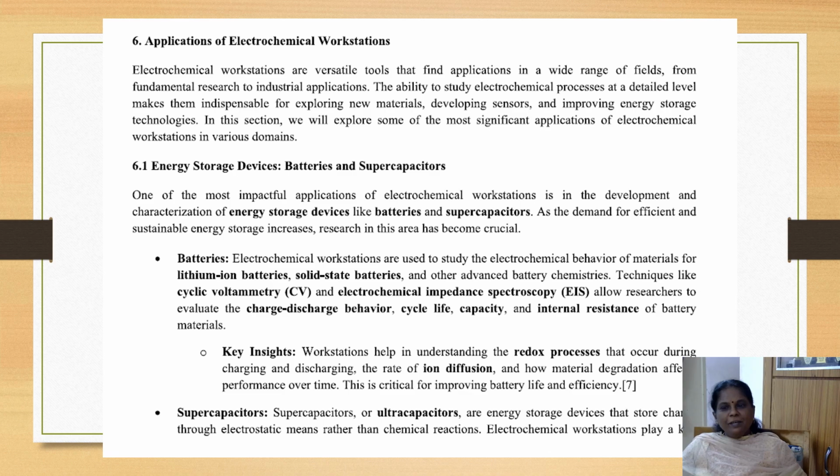So let us now see the applications of electrochemical workstations. First and foremost is in energy storage devices. We know that energy storage devices like batteries and supercapacitors are now in high demand. That is, more R&D is happening in this area because of the high demand for efficient and sustainable energy storage devices. Electrochemical workstations are used widely to study the electrochemical behavior of materials for lithium-ion batteries, solid-state batteries, and advanced battery chemistries.